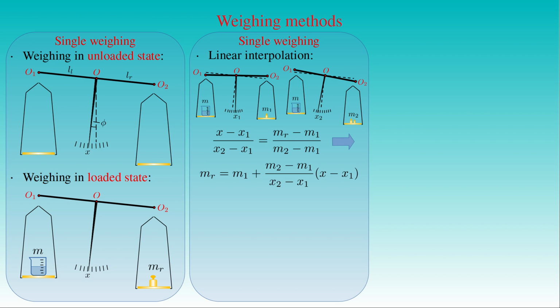At the same time, the linear interpolation applied here also helps to determine the sensitivity of the balance for the given load as the ratio of the difference between x_2 and x_1 to the difference between m_2 and m_1.